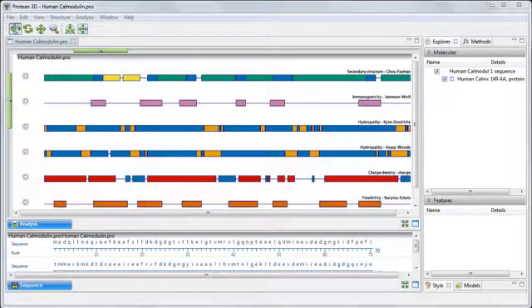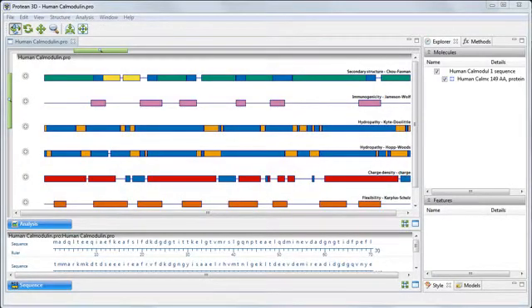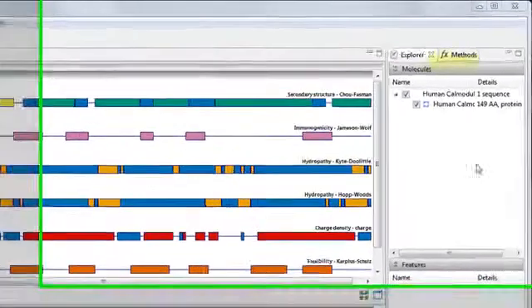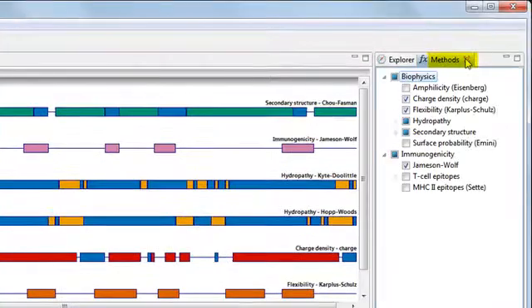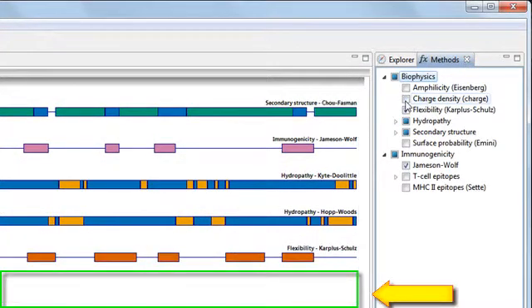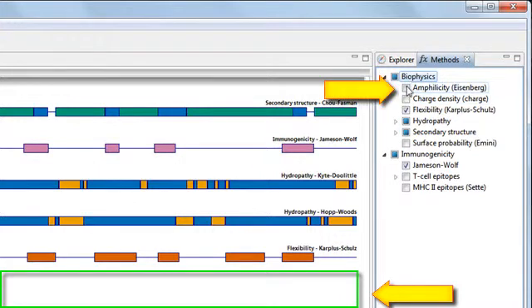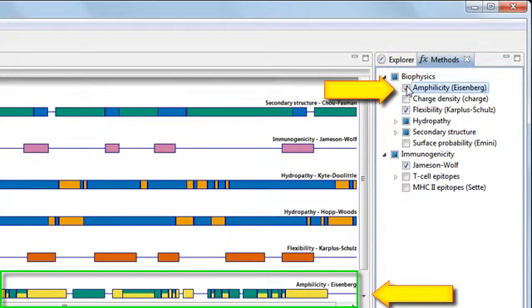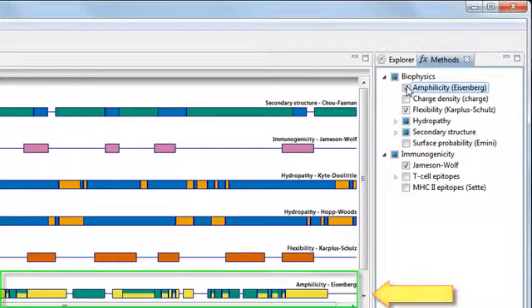To change which methods are applied or to add methods to the analysis view, click on the Methods tab and either remove a checkmark to remove the method from the analysis view or add a checkmark to add a different method.